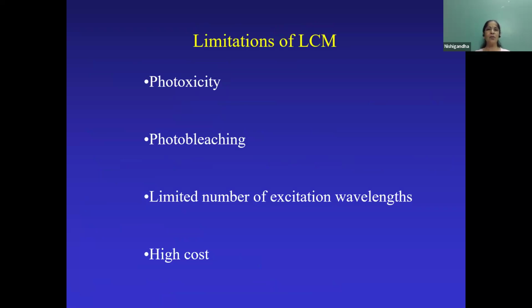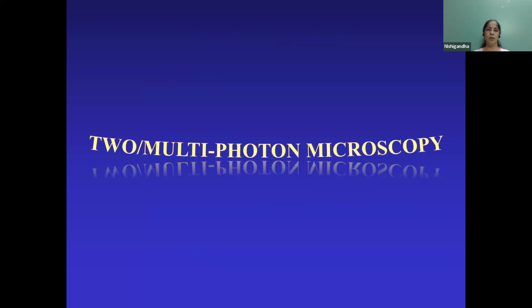However, like every coin has two sides, there are some limitations with LCM. One major limitation is phototoxicity. Since we are using a laser with high power, it might lead to toxicity. It would also lead to photobleaching because we are exposing the whole sample to the laser. Another important thing is that there are rather limited numbers of excitation wavelengths with lasers, and lasers are much costlier than any other source of illumination used for the fluorescence microscope.